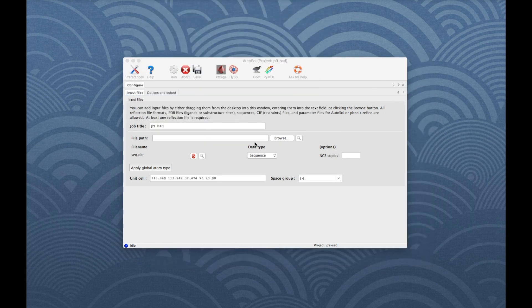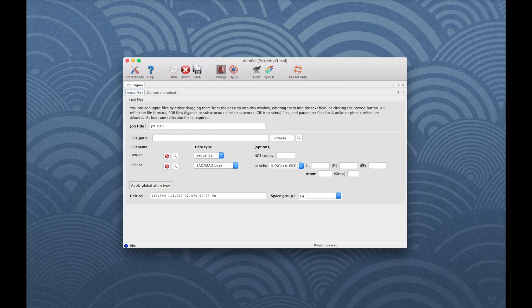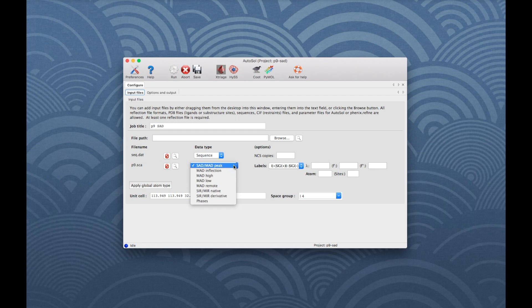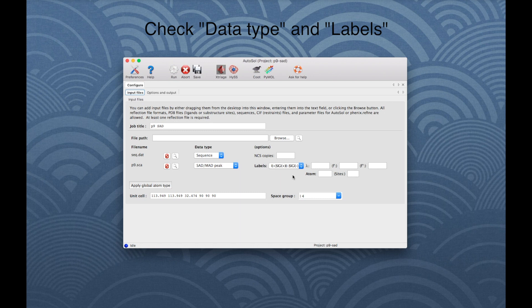Then load the data file, p9.sca, which is in scalepack format. The GUI has correctly guessed that this is a SAD or MAD peak wavelength dataset and also assigned the correct labels. If there are several data arrays in the reflection file, it is good to double-check the data type and the labels to make sure that they are correct.